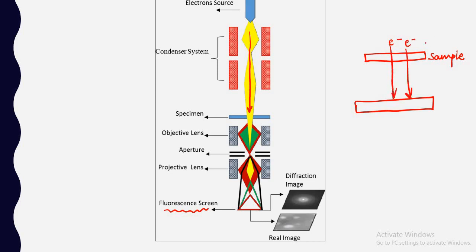Where you see, this electron will hit on the screen and you will have the light image. But here also electrons will get scattered, no? Because electrons are a beam, so they will scatter in all directions. So over here the electrons reaching are less. The electrons reached are very few.